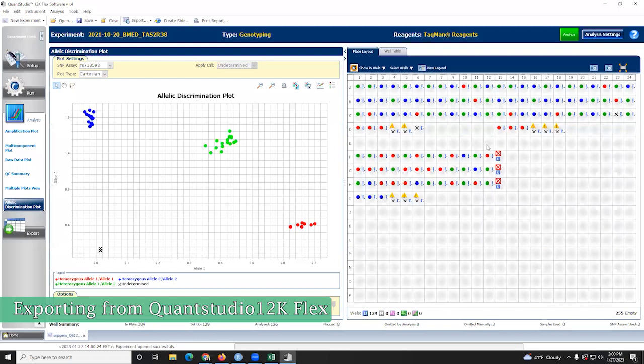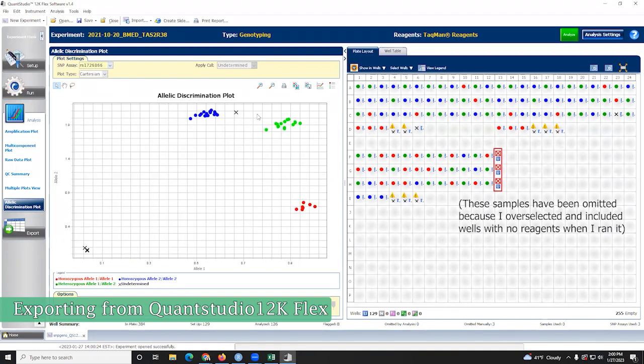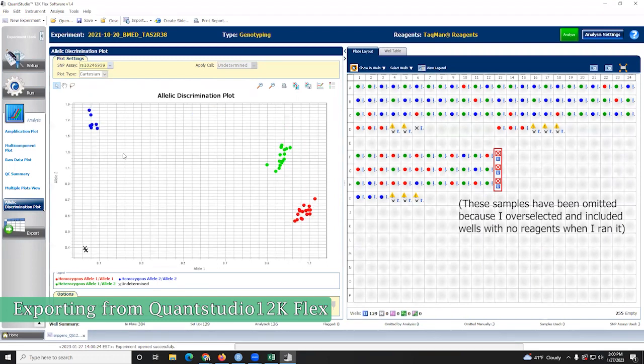You can see the first thing is the plate map of the different samples, like where they are on the plate. I don't usually fill up a whole plate because I'm running all the 3 SNPs, but I sort of repeat them across the plate and then run the different SNP assays in different parts of the plate. So you can click on the drop downs at the top left to get to the different SNPs and look at the different allele distributions.